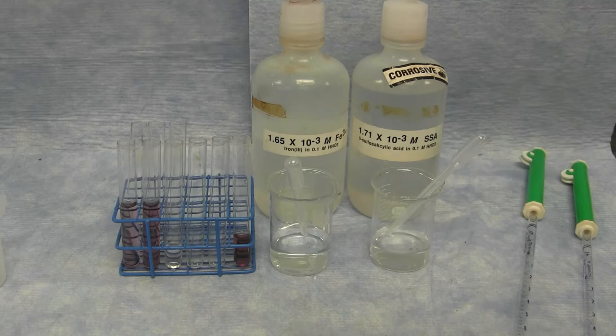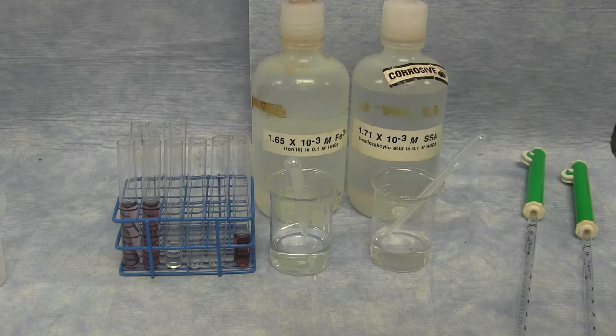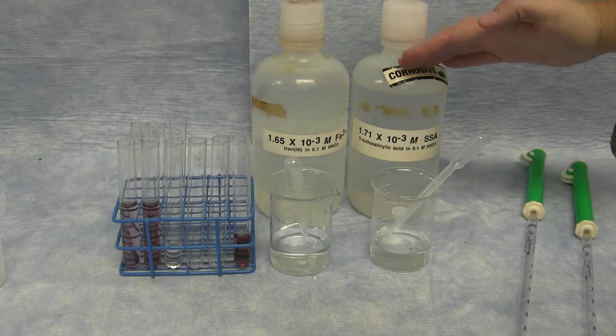As the ratio between the two compounds, iron 3 ion and the SSA, comes to its stoichiometric ratio, the intensity of that color and therefore the absorbance reading from the spectrophotometer will be at its height, and then will continue to fall as the ratio goes to the other side. By plotting this graph, you can figure out where is the maximum ratio that produces the most intense color and the highest absorbance. That is the ratio that produces the most of the colored product, and would be the ratio of iron and SSA in its final complex product.